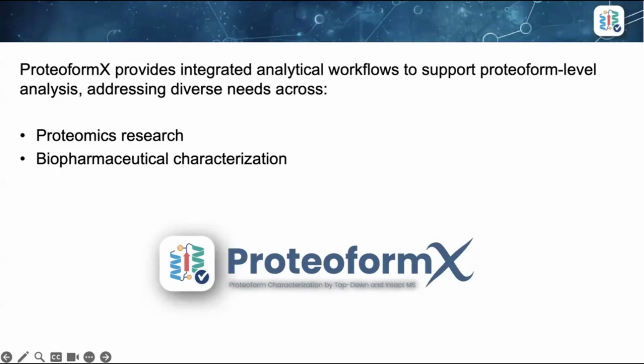Since ASMS last year, we released the ProteoformX 1.0 version, which focused on intact mass and top-down analysis. This week, we are excited to introduce version 1.5 with expanded capabilities. So today, I will walk you through the overview of ProteoformX and one of the workflows, the new peak detection.